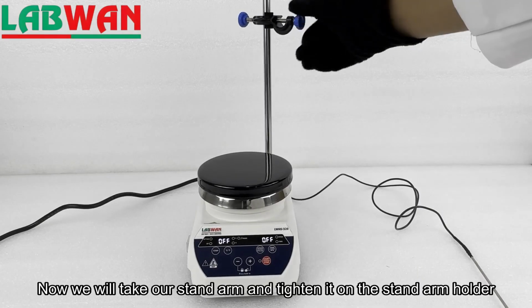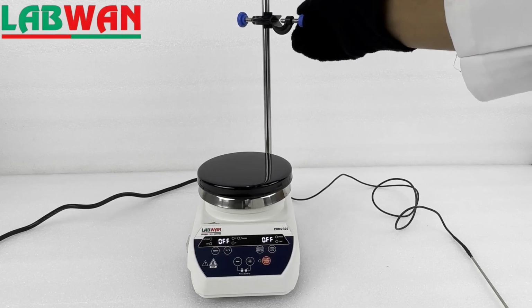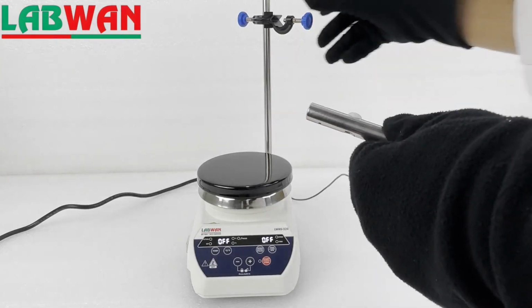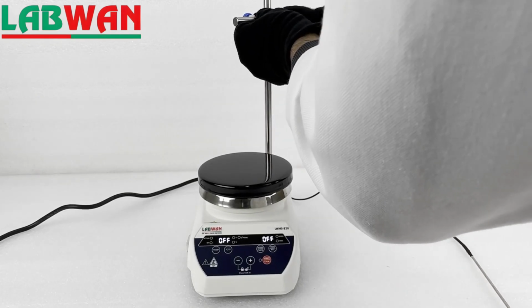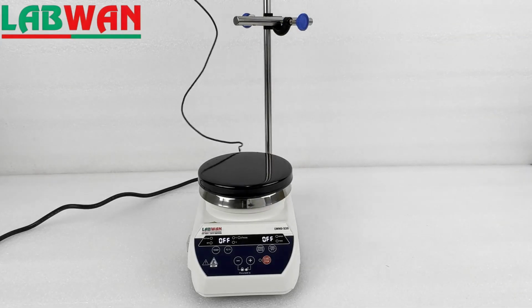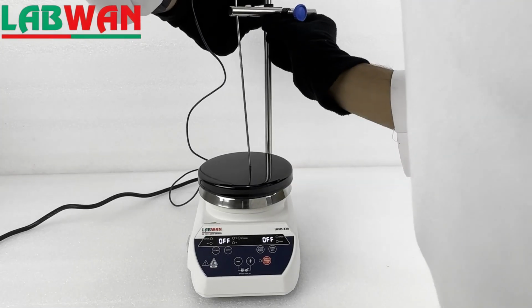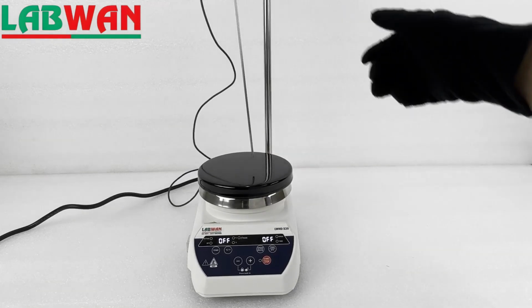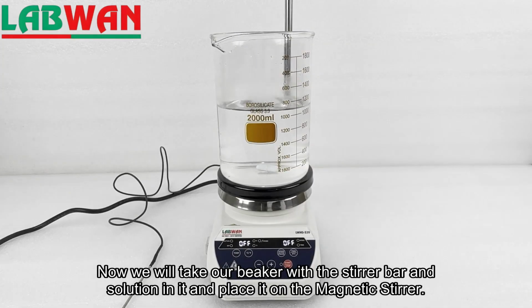Now we will take our stand arm and tighten it on the stand arm holder. Then we will insert the temperature probe into its slot on the stand arm. Now we will take our beaker with the stirrer bar and solution in it and place it on the magnetic stirrer.